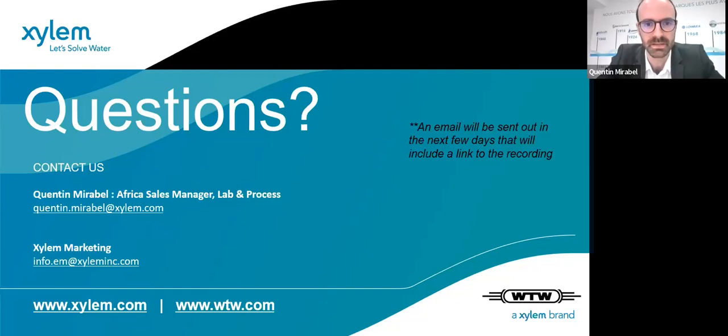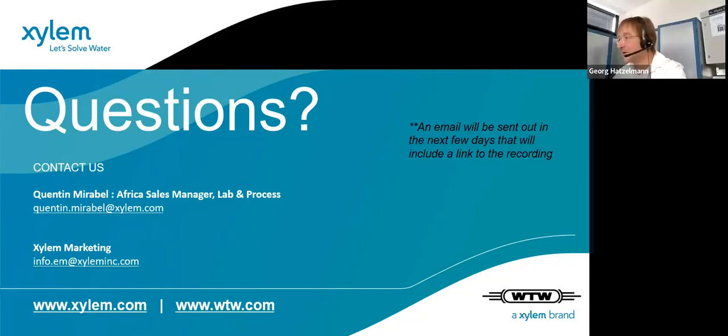Okay, I think time is running, Quentin. To speed it up, I will take the questions and answers directly. Then it's maybe a bit faster. There is a question if COD is effectively working in wastewater estimation. It's designed for municipal wastewater. It's a simple answer. Yes, it works.